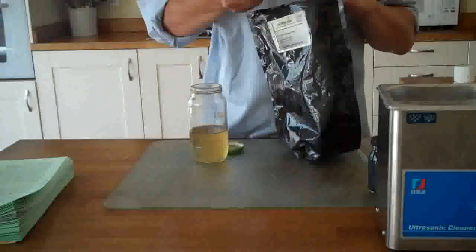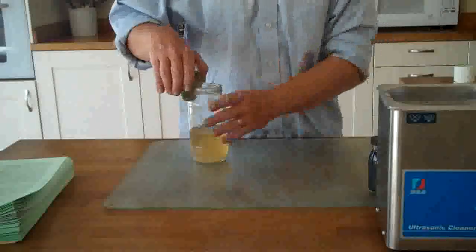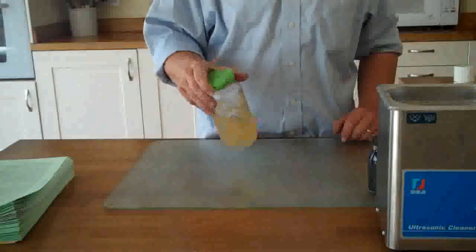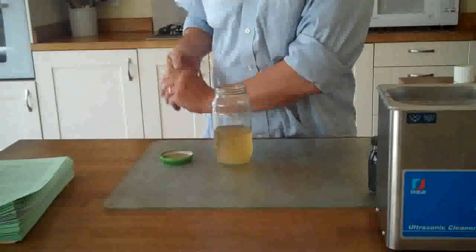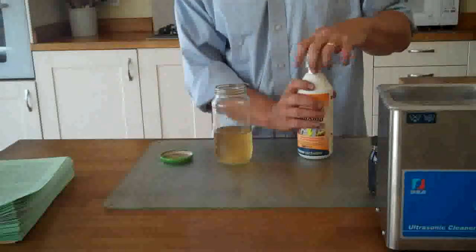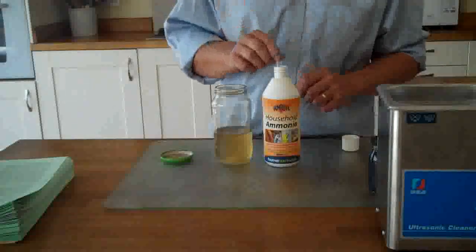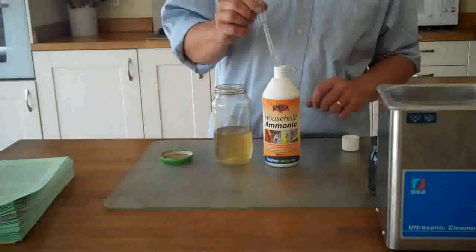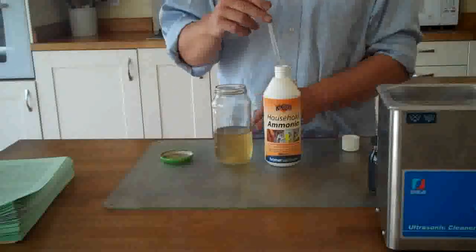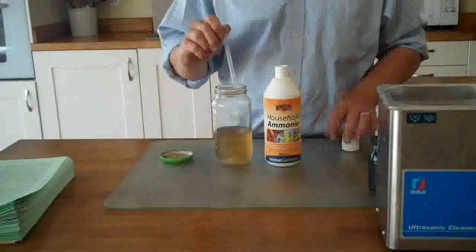Ascorbic acid is just vitamin C so you don't really need to worry about it. Give it a swirl around to make the ascorbic acid dissolve. And in order to stop that clumping up too much and to help the reaction go properly, you need to add a little bit of ammonia — ordinary household ammonia which is between 5 and 10%. You need to add 2 millilitres to that, so it's a 100 to 1 ratio: 200 millilitres of graphene oxide and 2 millilitres of ammonia.